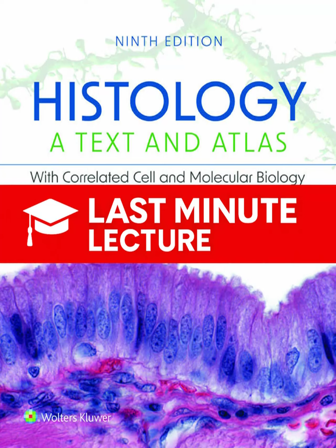And we can see this in an electron micrograph like figure 1.3a, which shows the localization of membrane ATPase. Yes, in figure 1.3a, you can see these specific, dark, electron-dense areas that are located precisely along the plasma membrane of epithelial cells. That dark area shows where the ATPase enzyme is active. And since we know that enzyme is the sodium pump, we can confirm that this specific part of the cell is responsible for active transport and ion balance in that tissue. It connects structure, enzyme activity, and function perfectly.